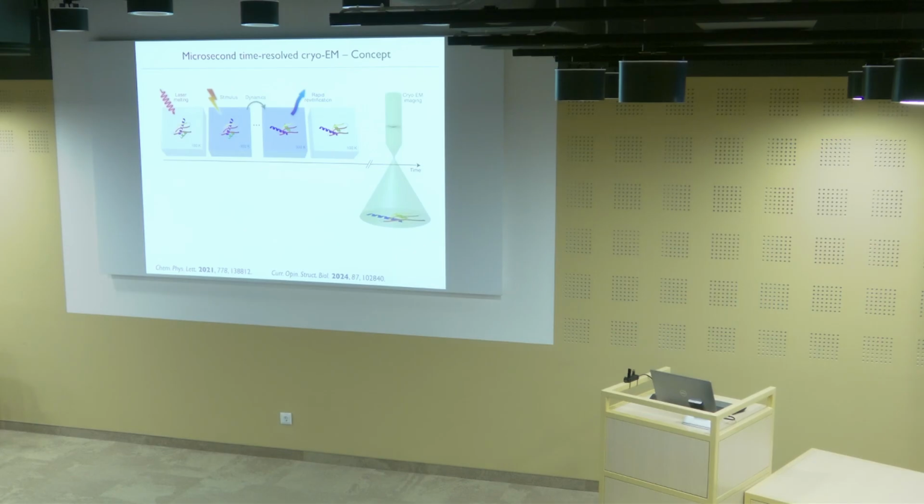And then even worse, at this point the sample actually would have to cool so rapidly that instead of crystallizing, it becomes vitreous, right? And so we've actually measured the cooling rate that you need to achieve vitrification very accurately recently, and you get a rate here of 10^6 Kelvin per second. So this is very fast, right? And so who tells me that actually my sample here would cool that rapidly? All right, so let me show you that this is possible.